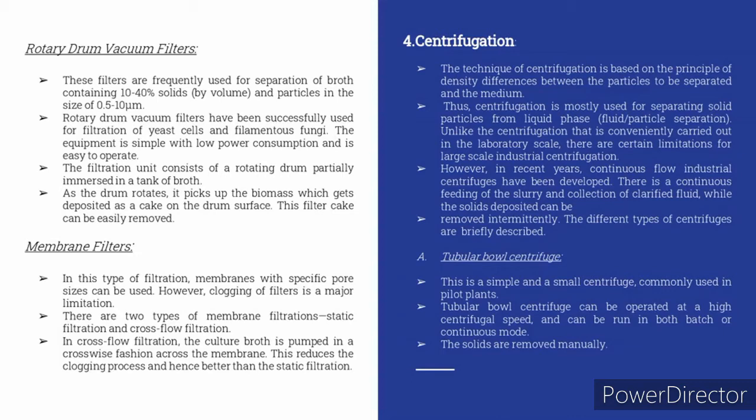Fourth type are the membrane filters. Membrane filters contain specific pore-sized membranes which can be used for the separation of compounds. Clogging of the filters is a major limitation while using membrane filters, and these are of 2 types. Static filters and cross flow filters.